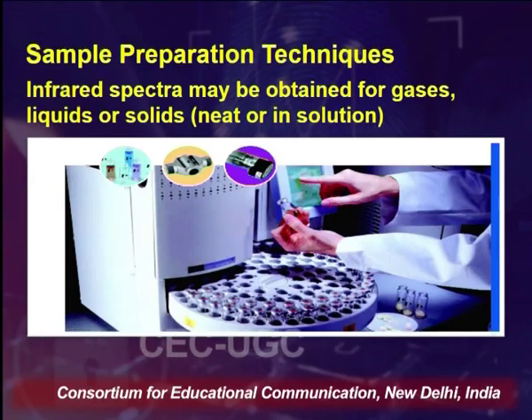So when we are using IR spectroscopy for analysis, depending upon what kind of sample we have, whether it is in solid, liquid or gaseous form, we can use it depending upon the sample we have encountered from the crime scene. So we categorize the sample into three parts: solids, liquids, and gases, and their preparation is different depending upon the sample. If we encounter a powdered sample from the crime scene, the preparation will be through the alkali halide method or maybe using Nujol.